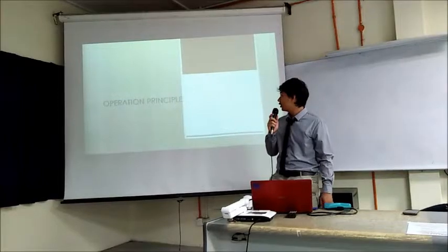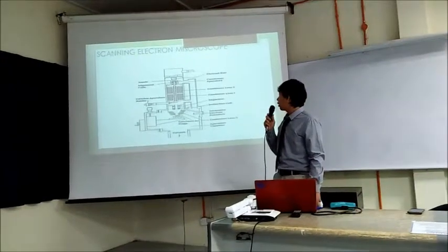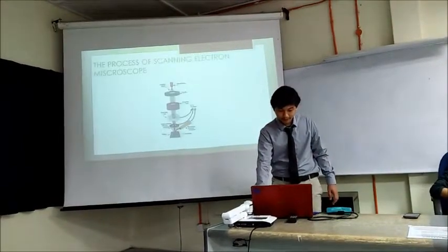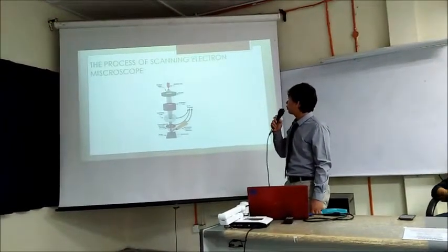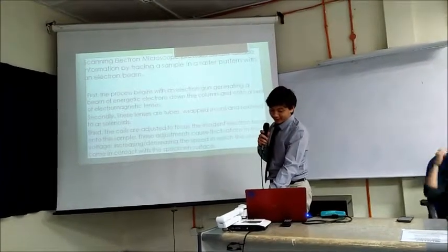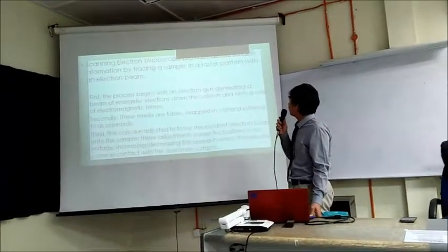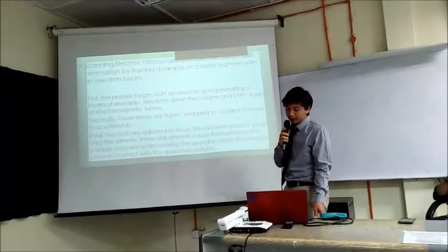I will present about the operation principles of SEM. This is a component in the scanning electron microscope. This is the process of the scanning electron microscope. First, the scanning electron microscope provides detailed surface information by scanning a sample in a raster pattern with an electron beam.